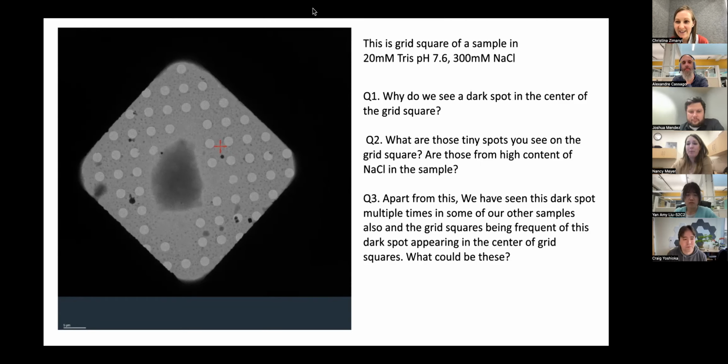Yeah, would love to try a buffer screen on a sample that has this issue consistently. All the centers are willing to sometimes brute force a data collection, especially if it's really important. This would be an example of something I would feel is kind of trying to brute force it, versus getting a better grid, which you'll just collect much better data at much higher rates on.